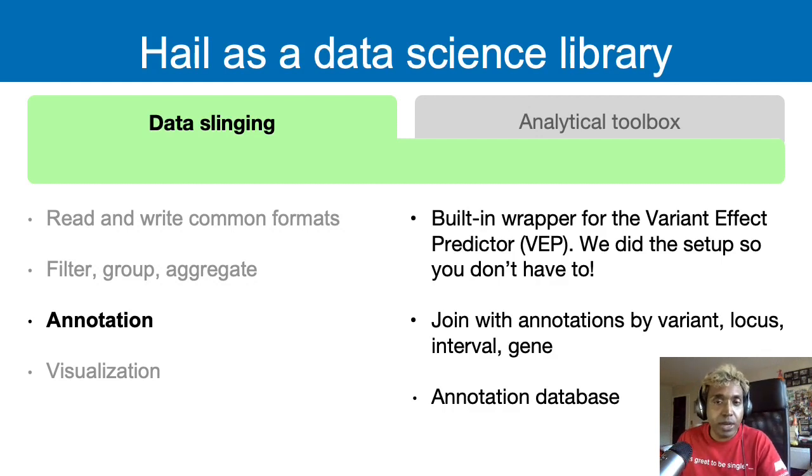I will not be demonstrating this during your practicals, but I'm happy to walk you through some of this and also point you to some of the resources on Hail if you want. This is one of my most exciting tools, if you will, other than the VCF combiner in video number 3, just because VEP was such a pain for me in grad school.